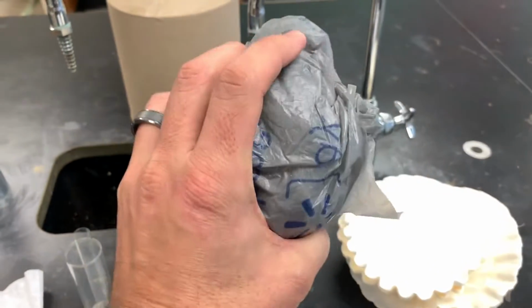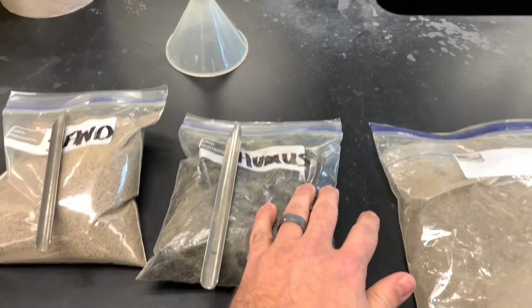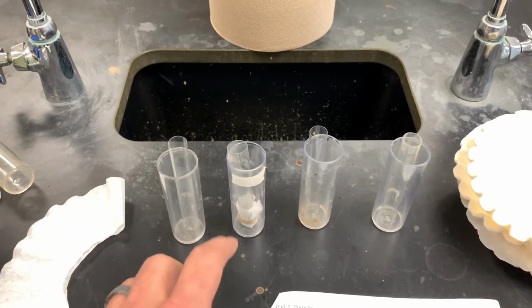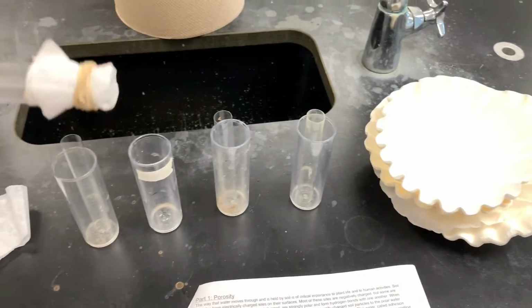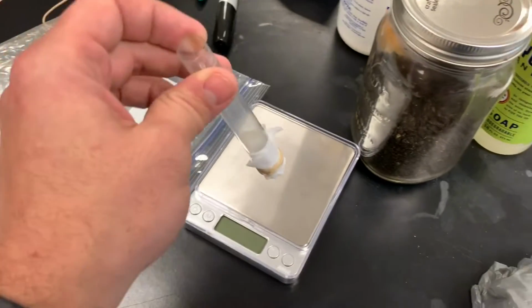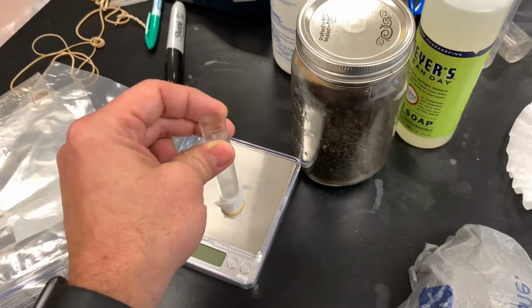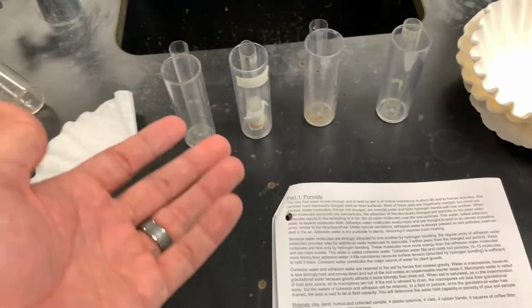Clay will be in this bag right here. It's actual clay. And then here's sand and here's humus, which you'll put into your vial here. And then basically you're going to follow the directions. It tells you to first measure the mass of the vial using an electronic scale. Then you're going to put your soil in there, and then you'll measure it when it's full of soil. And then the directions will tell you to put a certain amount of water in there. I think it's 10 milliliters.